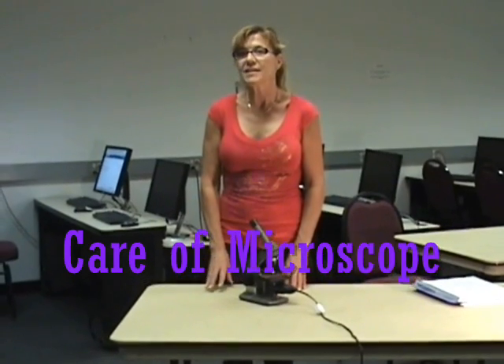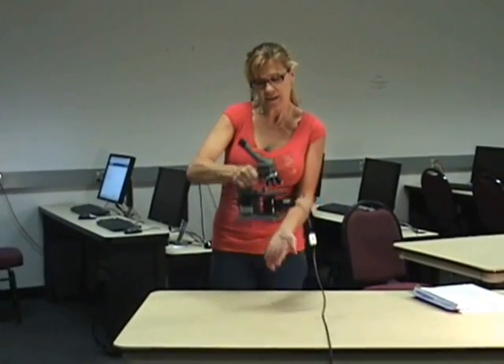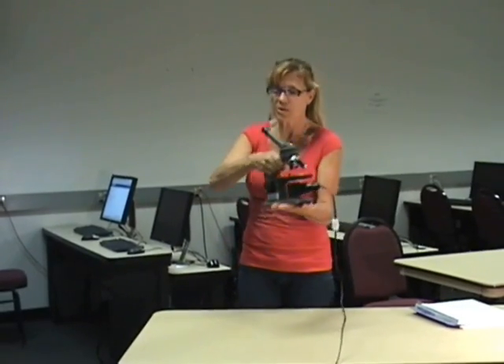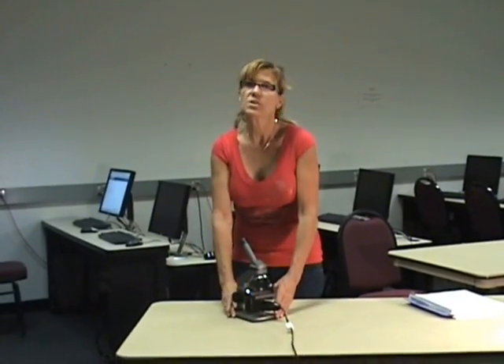We'll talk about the care and use of the microscope. When you're transporting your microscope, always carry it with the arm in one hand and your hand under the base to take it to your table. Make sure that your table is sturdy, not wobbly, and be sure to put it in the center of the table so it's not on the edge where it's possible to fall over.